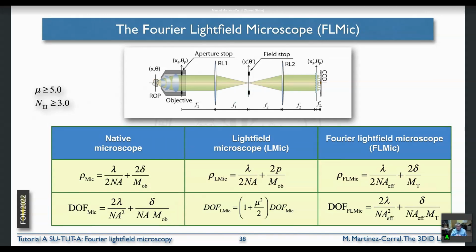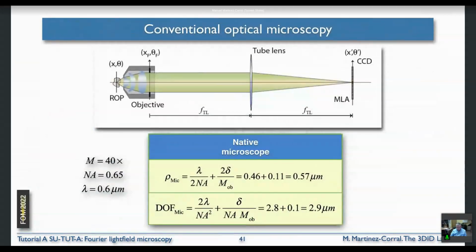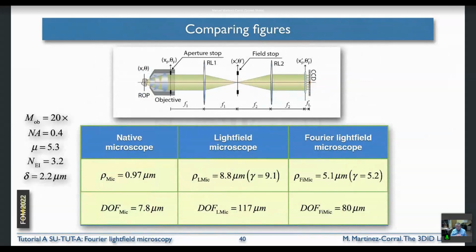About that, as far as we have experimented, the depth of field is pretty good. But in the same relation as here: the smaller the resolution limit, the smaller the depth of field.